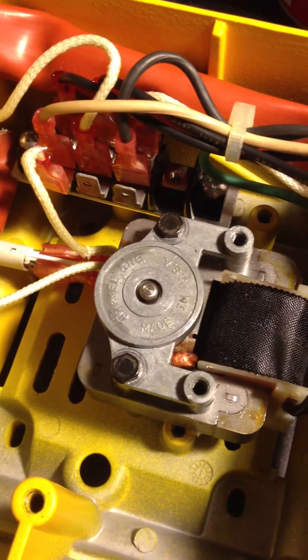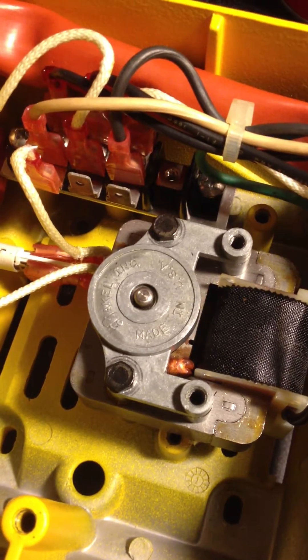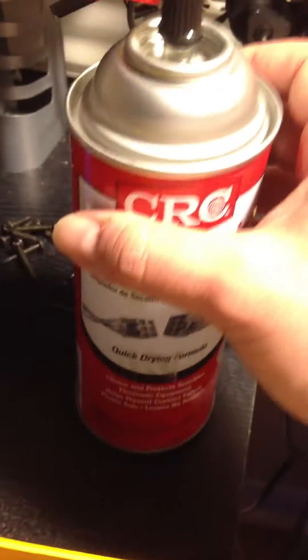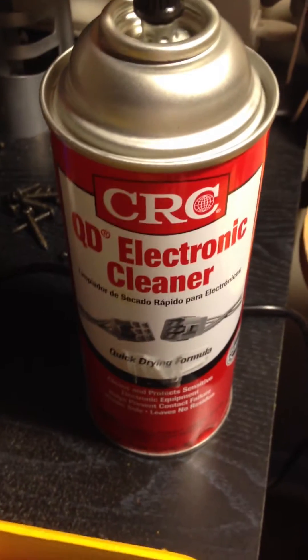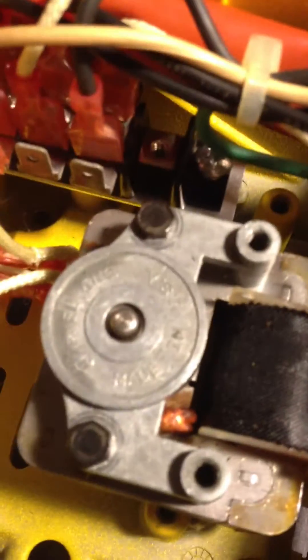Today I'm going to show you how to clean an electric motor with contact cleaner and fix it using 3-in-1 oil. So basically you get some contact cleaner, some 3-in-1 oil, and you have a motor. This works with fan motors and stuff like that too.